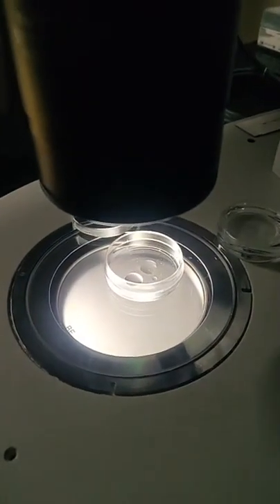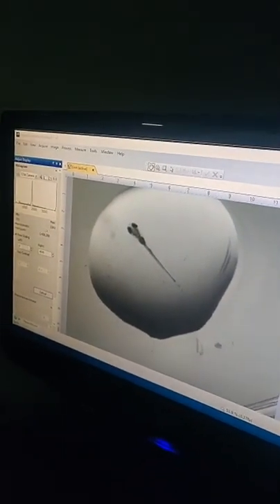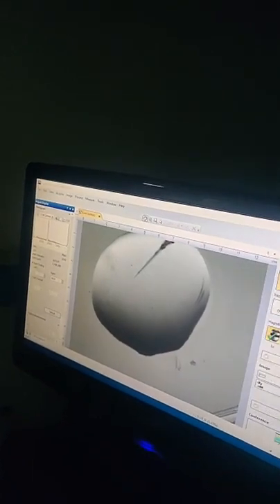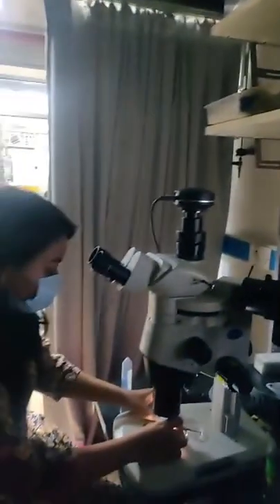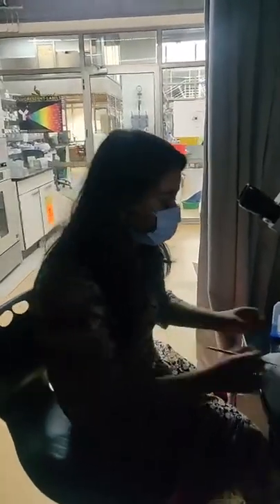So movement is what we want to study. It's so tiny, I can't see it nicely with my naked eye. It's a few millimeters in size. Oh, really? Yes. As you're seeing, the fish is moving. We are also interested in how the brain is generating these movements, and what neurons in the brain participate in executing them. Neurons are the cells that are present in the brain.